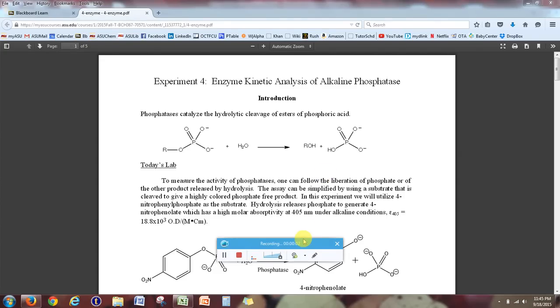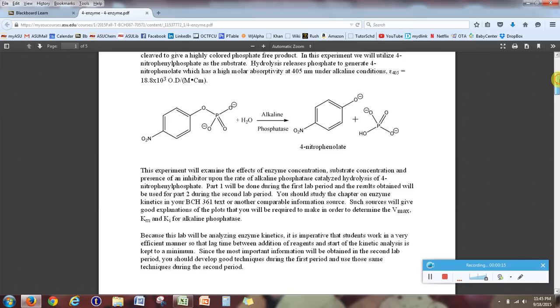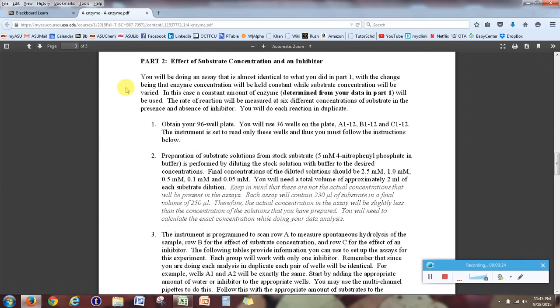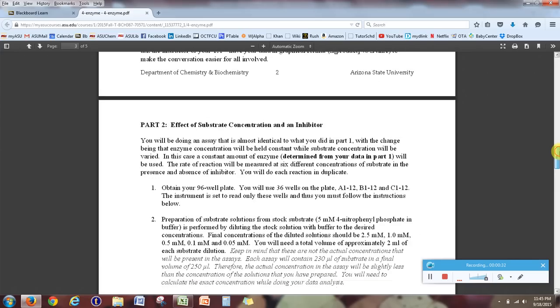Hello again. So this is going to be the second video as it relates to Enzyme Kinetics lab for biochemistry, and remember this is an Excel tutorial video. So I've already made one video going over part 1 or week 1, basically page 2 of the handout. So this video will be covering the data analysis that you need to do for week 2. So that is pages 3 and 4 of the handout.